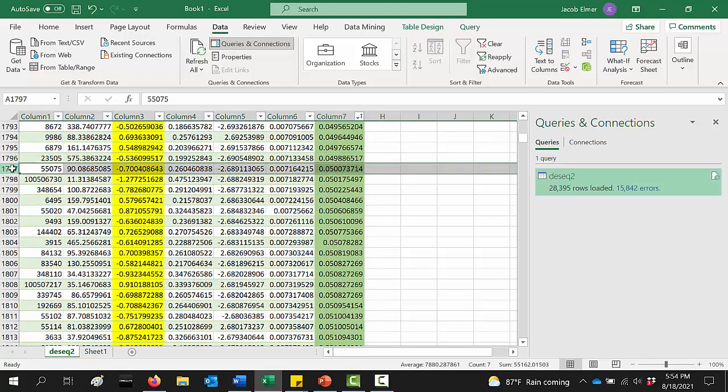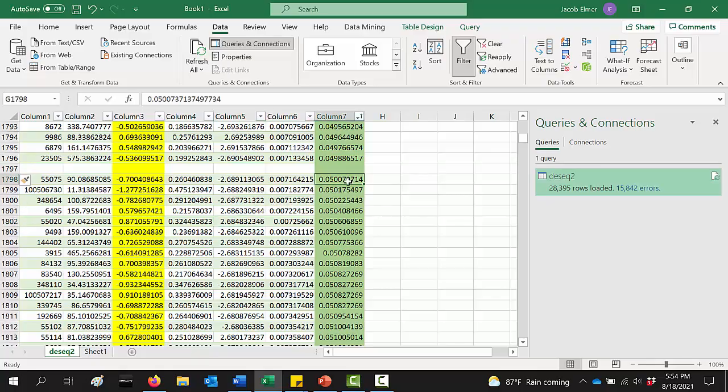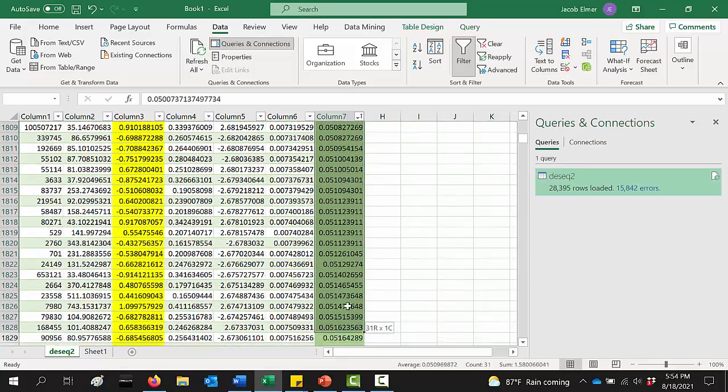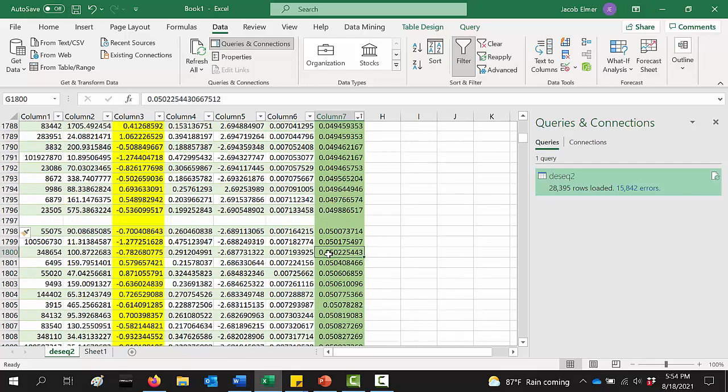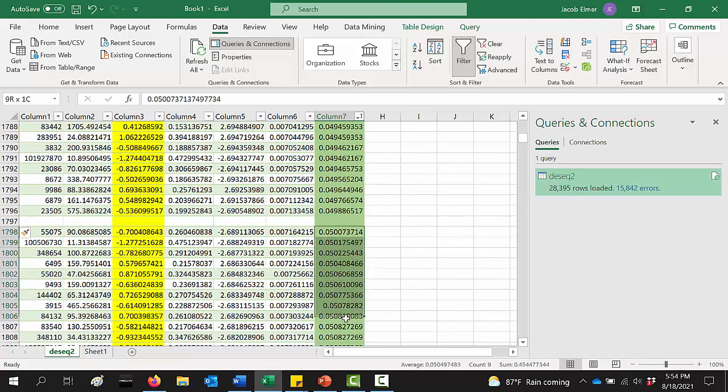So you can see here, after we go through 1,800 genes, right there, I'm going to insert a row, because every one of these genes down here, since that p-adjusted value is greater than 0.05, these we can define as not being significantly higher or lower in the transfected cells compared to the untransfected cells. Okay? So these are genes that are not upregulated or downregulated. But you can see here we still have 1,800 different genes to choose from.